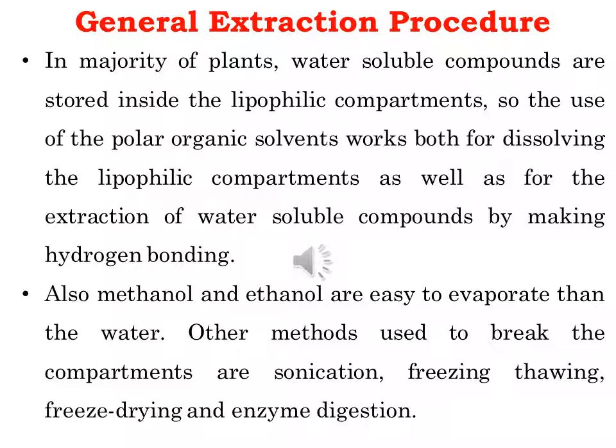Other methods used to break the lipophilic compartments include sonication, freezing, thawing, freeze drying, and enzyme digestion. So one can use any one of these methods for the breaking of the lipophilic compartments, or one may also apply more than one method for the extraction of water-soluble molecules from the lipophilic compartments.